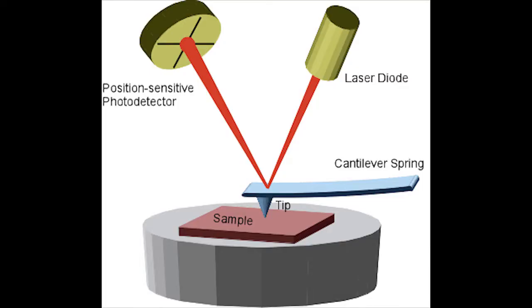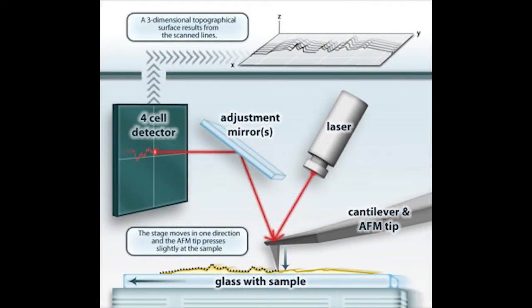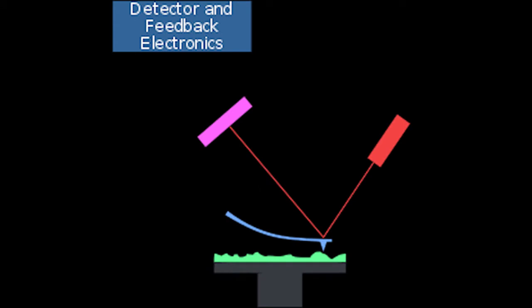What is AFM? AFM, or atomic force microscopy, is a way to image and analyze a sample for measuring local properties, like the dimensions of the sample. The AFM measures these properties by raster scanning the sample with a probe, which sends feedback to the sensors and the data is collected. This is unique because it is not limited by optical resolution but rather the size and sensitivity of the probe.